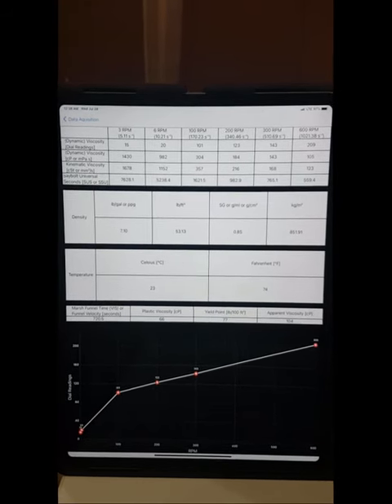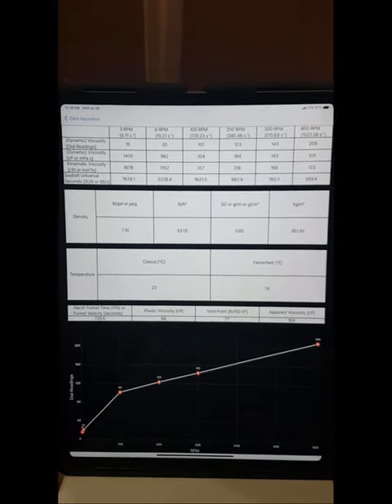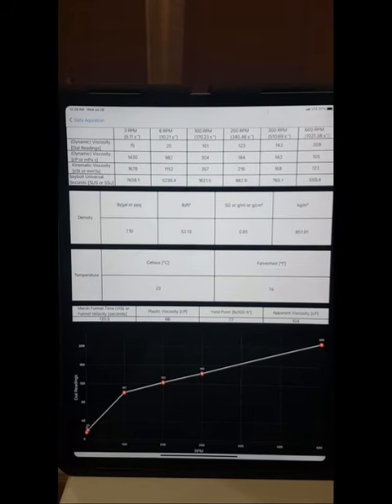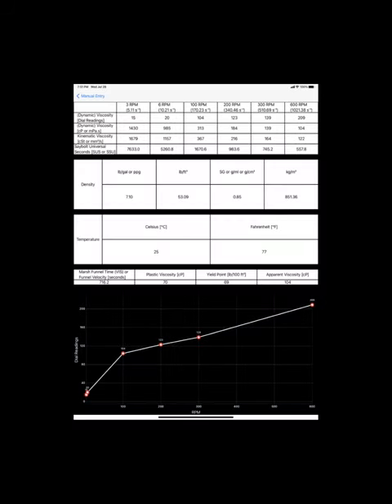These precise measurements would normally have required at least three pieces of equipment in at least 10 minutes to perform, but the Goblet Viscometer dramatically simplifies and quickens the process.